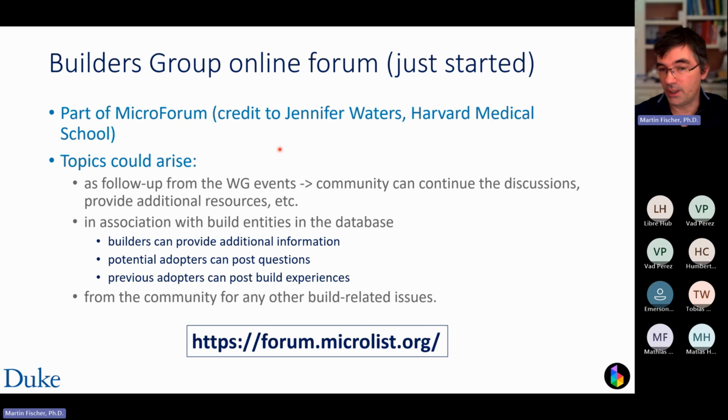So these posts can be follow-ups from these working group seminars. Maybe it's just a way to continue the discussion of these topics. It could be related to these entries in the database, in the MicroscopyDB database, and I'll show you an example of this. It's a nice place to provide additional information, for people to actually post a question and then hopefully get an answer. And of course, when people build it, they can post their build experiences, maybe updates, things like that. And generally for the microscopy community, for any other build-related questions.